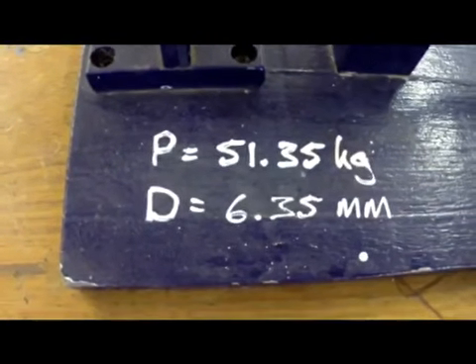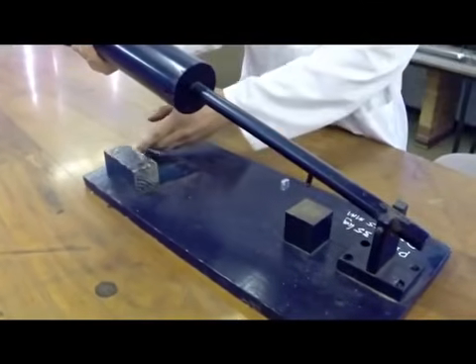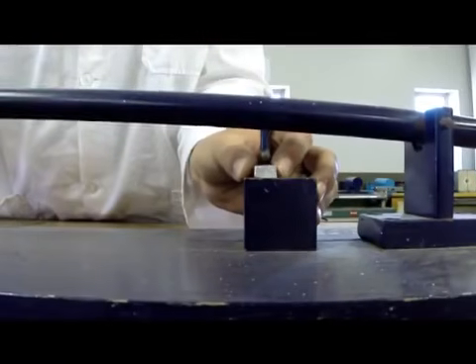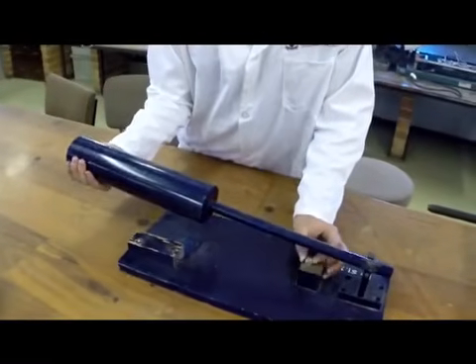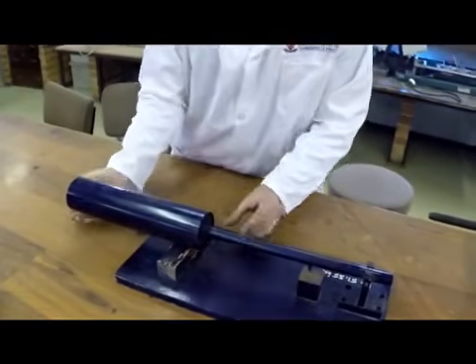Lift the load and remove the wooden block that it rests on. Place the sample under the steel ball and gently apply the load to the sample. Leave the load on the sample for exactly 30 seconds before removing the load. Place the wooden block under the load when there is no sample under the steel ball. Use an eyepiece to measure the diameter of the indentation.